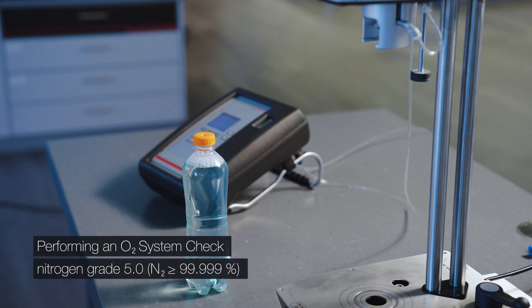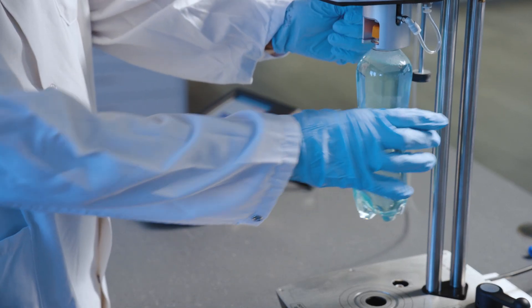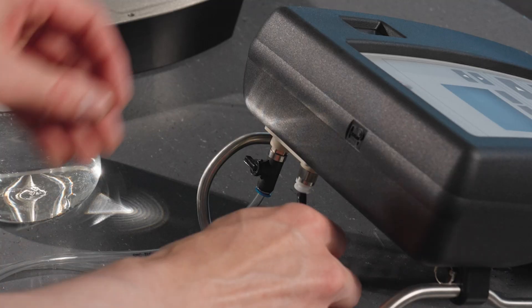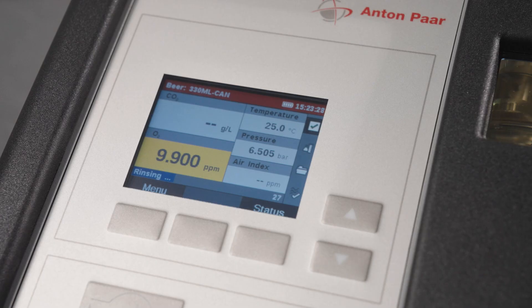Perform an O2 system check once a week with pure nitrogen. The check verifies the zero point of the O2 measurement. First clean the instrument using a cleaning agent, then connect the sample inlet to a gas and oil-free compressed air supply. Dry by rinsing for at least 4 minutes at approximately 3 bar relative pressure.